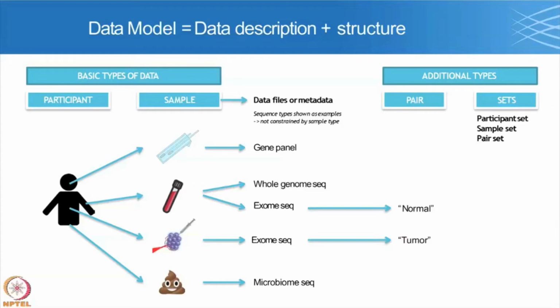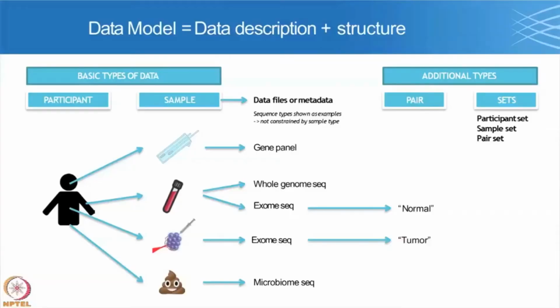And then, in order to enable some sort of automated batch processing, say you want to align whole exome data for a sample, and you want to do this for your entire study. Your study has 100 people. Instead of invoking it 100 times on a sample, you can create a sample set, and then say I want to run my alignment on the sample set, and FireCloud will automatically create 100 jobs, one for each sample, and do everything in parallel and get things done quickly.